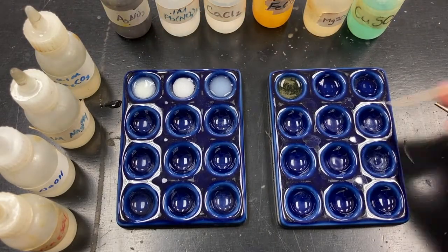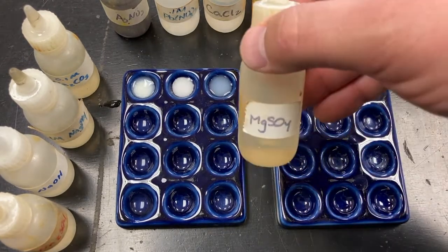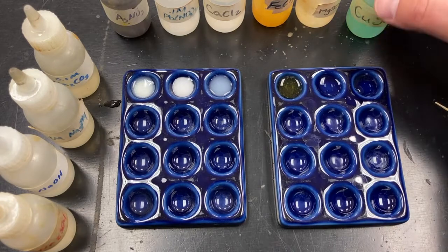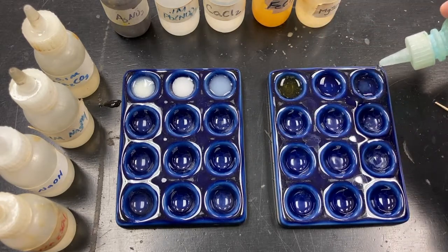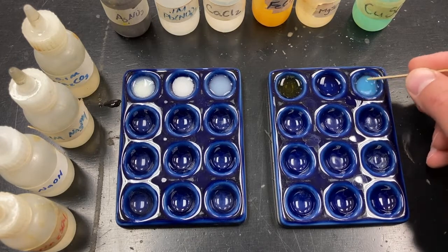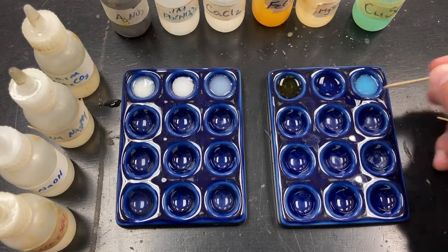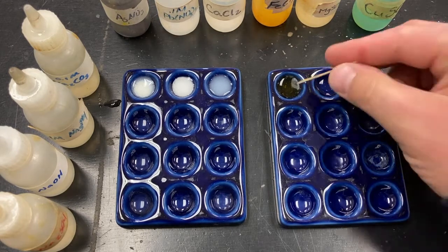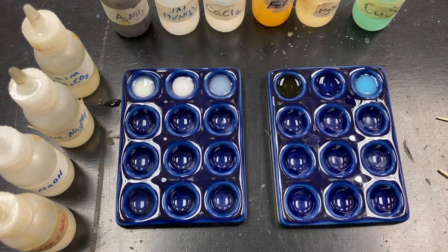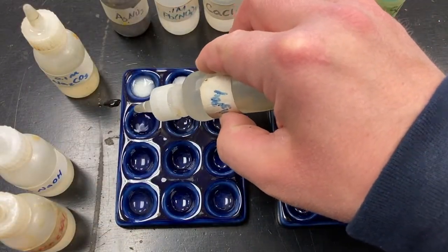Okay. Magnesium sulfate. I don't see anything there. And copper sulfate. Okay, so there's another very faint, almost a powder blue solid. Powder blue, very fine solid. Okay. And the iron chloride formed a red solid. Okay, let's move on to sodium phosphate. We'll do every square or every cell.